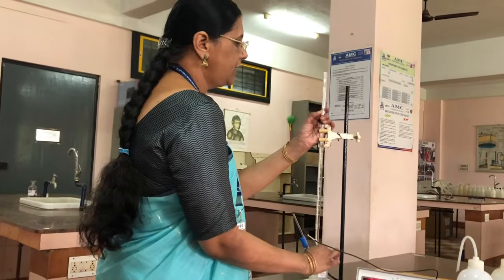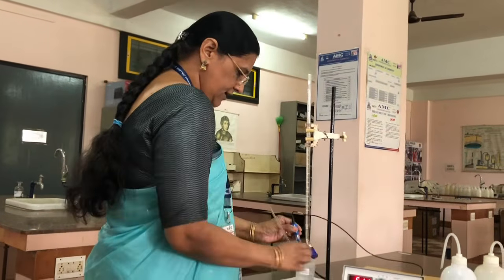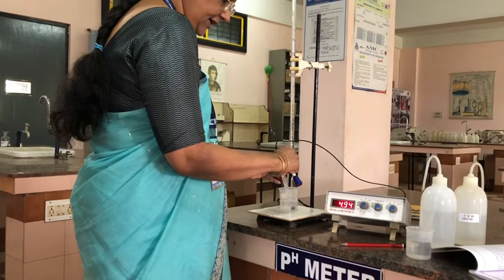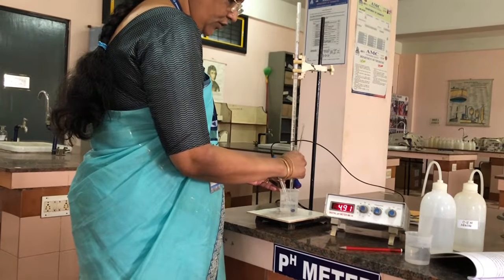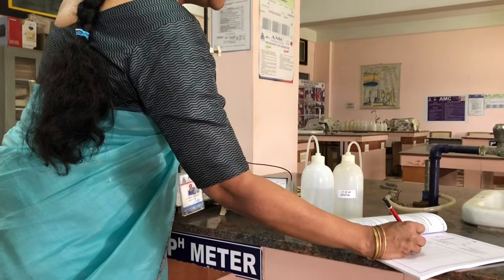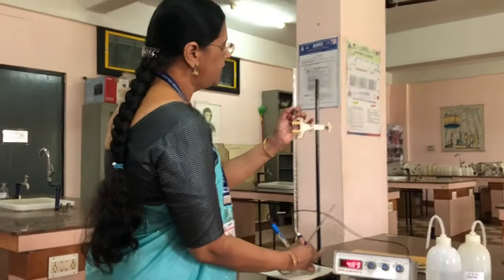Only 0.5 ml, not more than that, because we need more readings to plot the graph. So again we have to shake the solution, and this electrode is selective to H plus ions, so it will give you the pH of the solution. Now it is 4.90. Now again we have to add 0.5 ml.